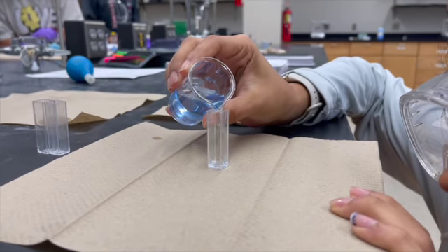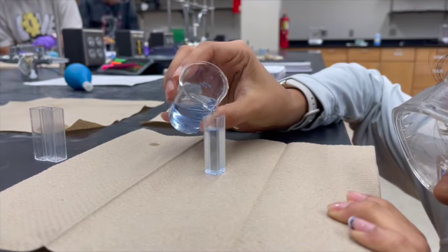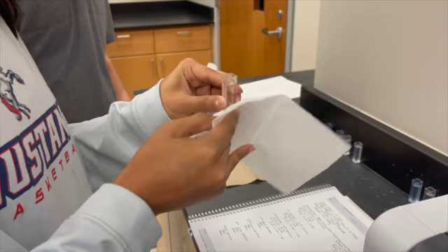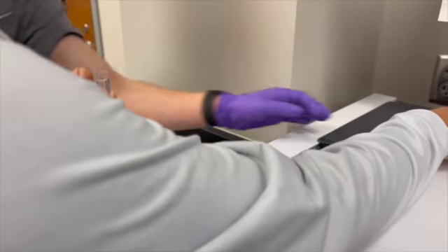We transferred enough solution into the cuvette but not a lot. We wiped the two sides of the cuvette with the chem wipe and then we confirmed that the spectrophotometer had been zeroed using the blank solution.